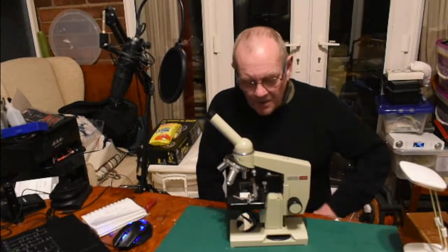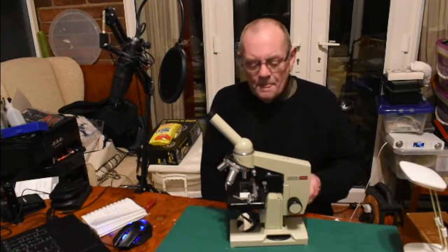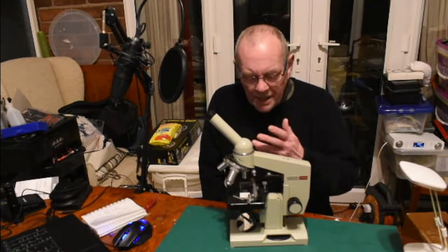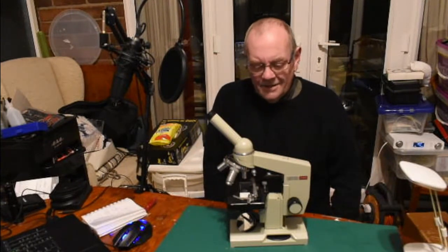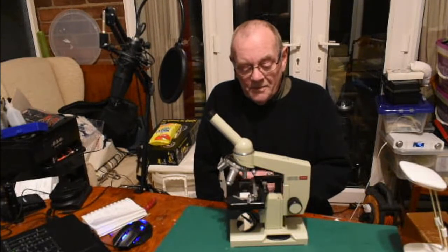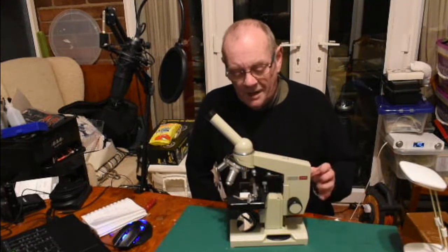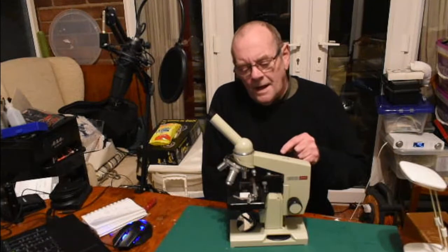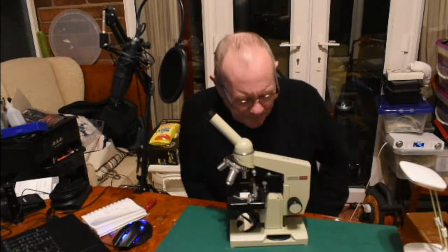In today's video I'm looking at a microscope. Why am I doing it? Well, number one it's a great hobby, it's a hobby you can share with kids, there are so many things you can look at. During lockdown it's a fantastic hobby. This video isn't going to be a tutorial on how to use a microscope — I just want to explore a way of obtaining a decent microscope for very little money.